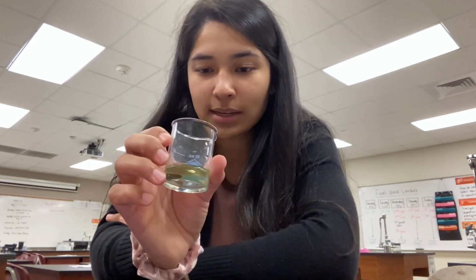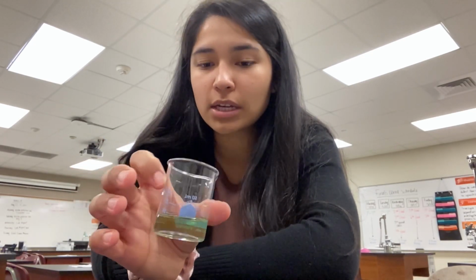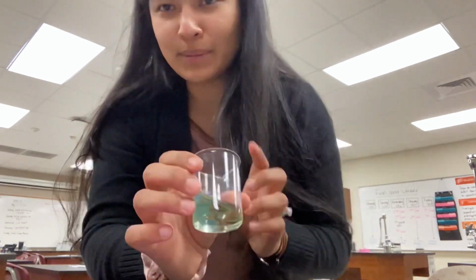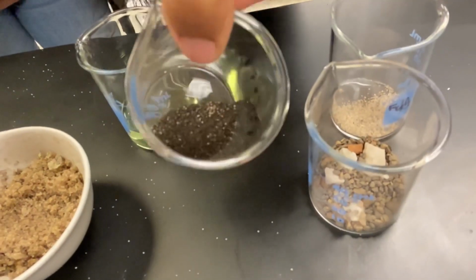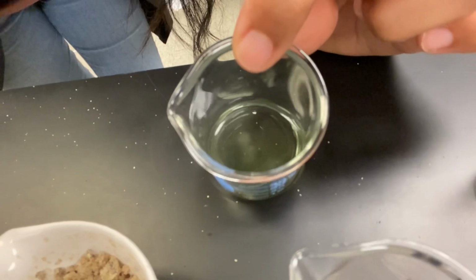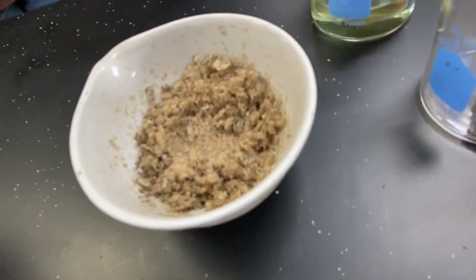I'm going to then take this to a separate evaporating dish and allow it to evaporate. So heat up the hot plate, allow the water to be boiled away, and then collect all of your solid sample. Like I said, I'm not going to do this part because it takes a little while, but you would end up with your original mixtures. So we had our pebbles of various sizes, we have our pepper, we have our iron filings. Here, obviously, it's still in solution, but if we were to evaporate it, we would end up with the solid, our copper nitrate and salt, and then the sand.